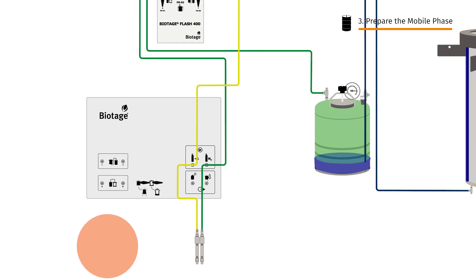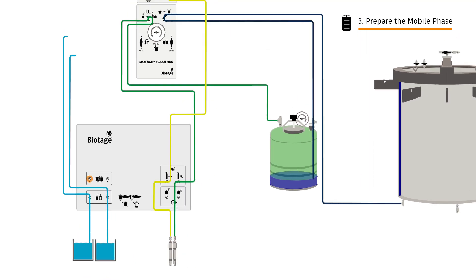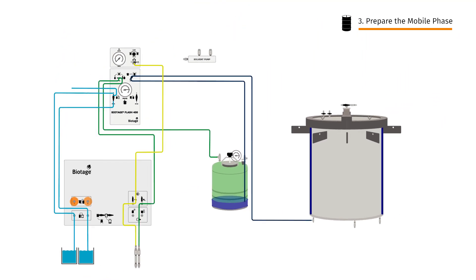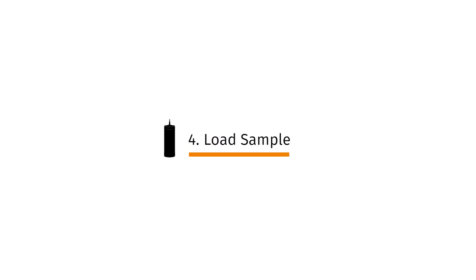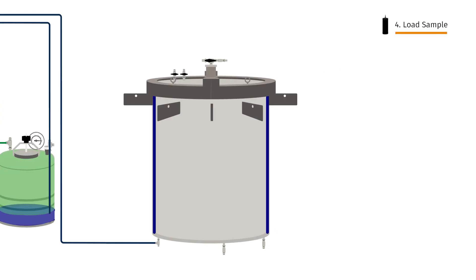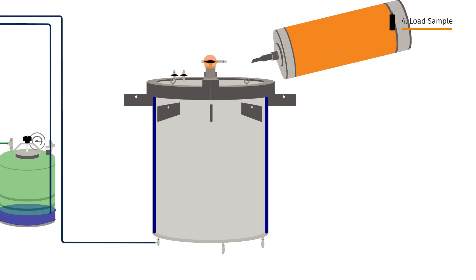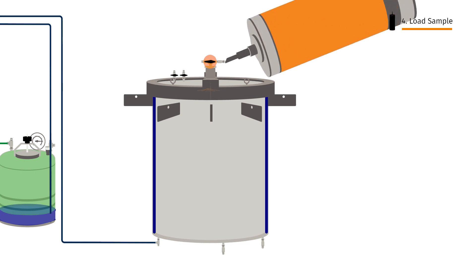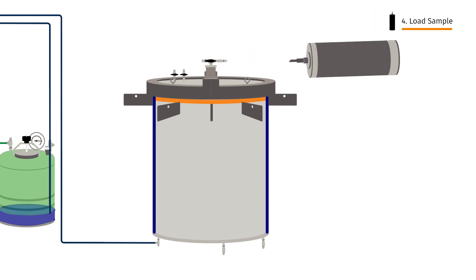Then we'll connect our solvent lines to the solvent inlets and collection lines to the outlets. Samples are easily loaded via the three-way injection valve at the top of the compression module and perfectly applied to the column via the distribution plate built into each cartridge. We're now ready to start.